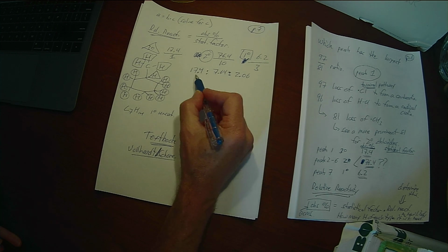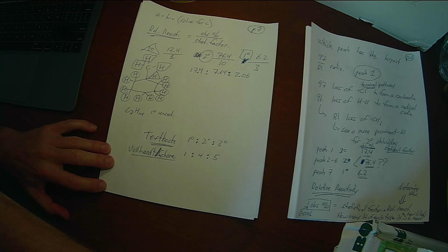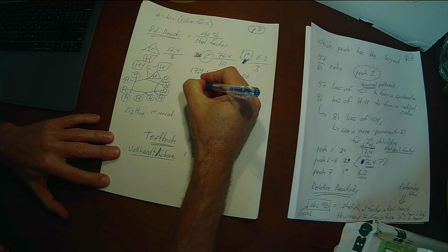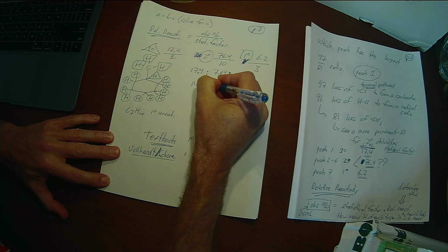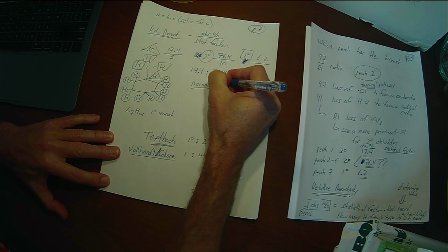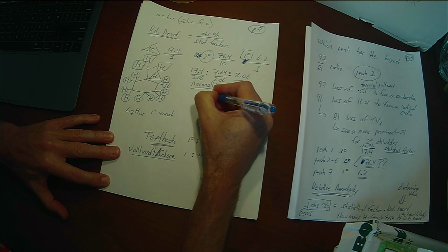Anybody? What am I going to do with these numbers? What do I have to do to normalize them so I can compare them to the 1 to 4 to 5 ratio? Yes, indeed. Divide through by the smallest one. So normalize by dividing each through by 2.06, so that the primary becomes 1.